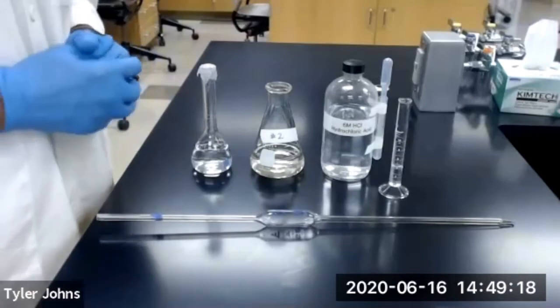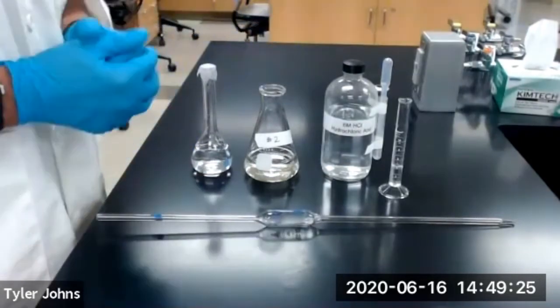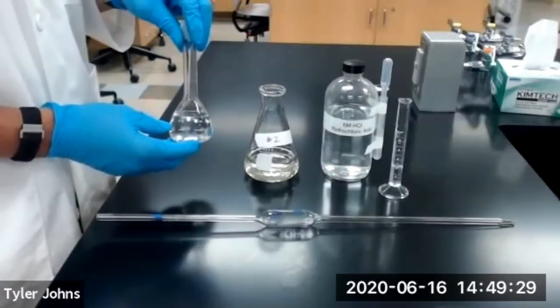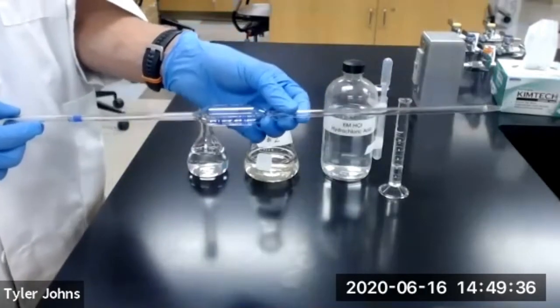We're now going to prepare Erlenmeyer flask number 2 for trial number 2. So again, we need to transfer 25 milliliters of our diluted bleach solution using an analytical pipette. And again, we have our 25 milliliter analytical pipette or volumetric pipette.